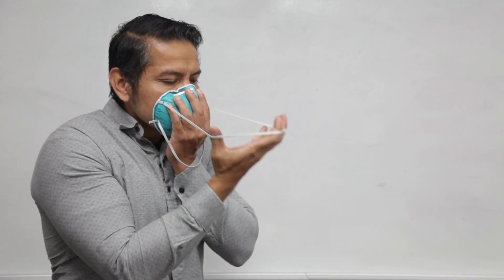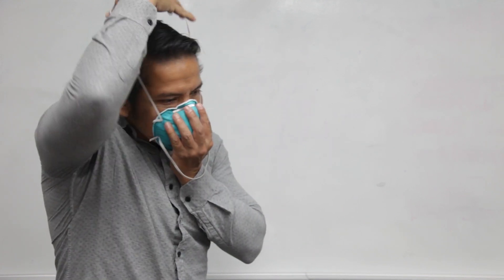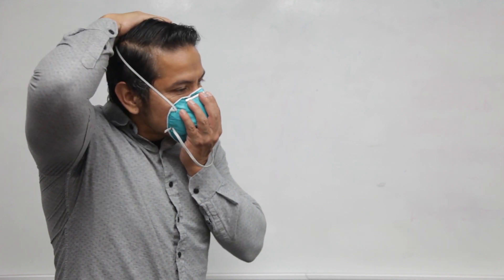While holding the mask in position, pull the top headband over your head, resting it on the crown part on the back of your head.